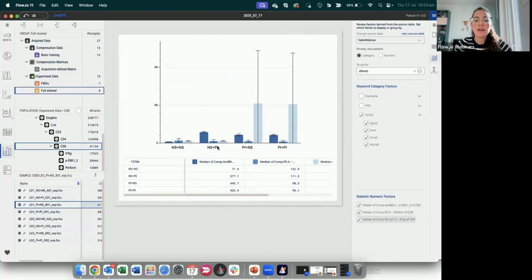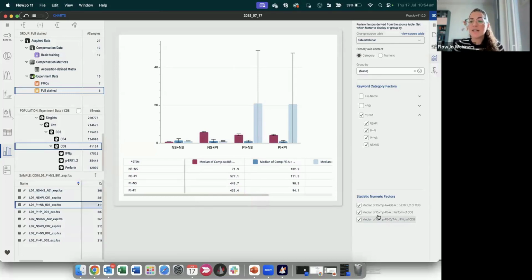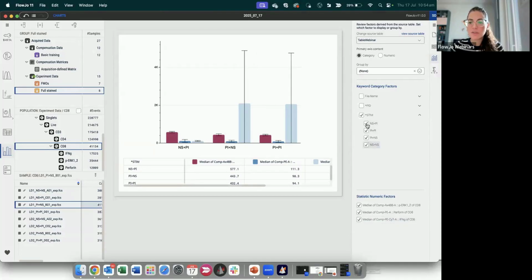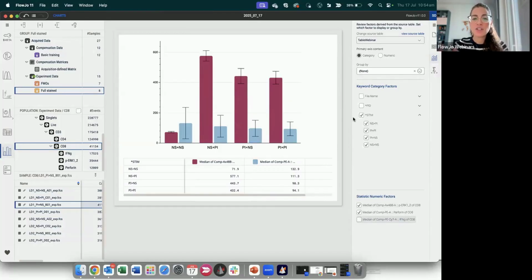Here you go. So now I have my 4 different conditions. I'm comparing between different conditions. I'm comparing the 3 different statistics in different colors. You can always set the color of interest, the color that you prefer. Okay, up to you. There are tons of different palettes there. And you see this error bar is huge. What is that? This is my non-stimulating. No, probably this one. Okay, so I can add, remove, and adjust everything in my chart, and it's actually live.